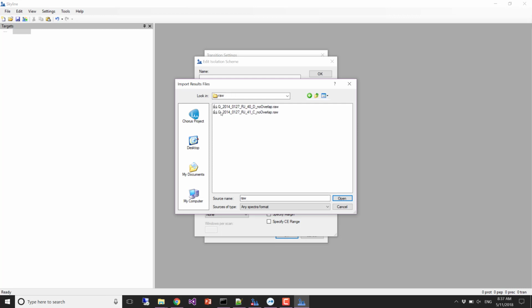Because we got a data set from Bruker where they told us their isolation scheme, and then when we eventually looked at the data, it didn't work right, and we were like, you actually mistyped one of the windows. And luckily, it was one of the windows near the end, so we just pretended that the isolation scheme had a narrower range than it actually had.